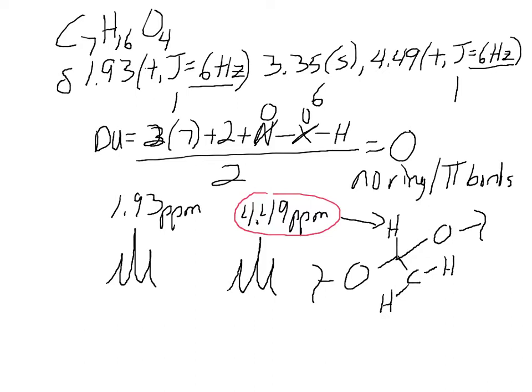and how many peaks? 3, and 16 hydrogens. That should send off a signal in your head. This molecule is probably very saturated, but if I only have 3 peaks with 16 H's, symmetry. Think about symmetry. This molecule is probably very symmetrical. Right? It's probably very symmetrical.